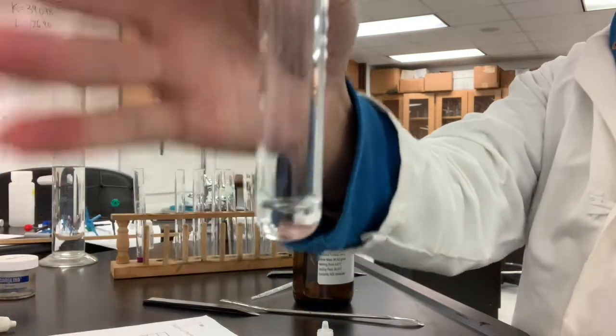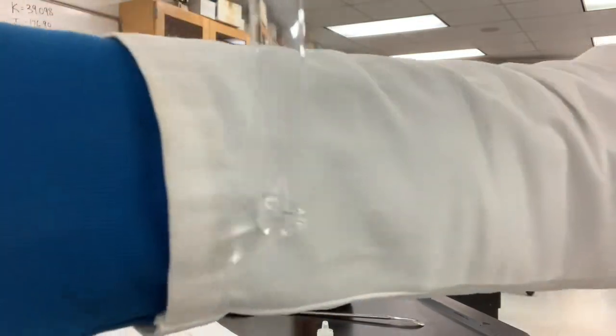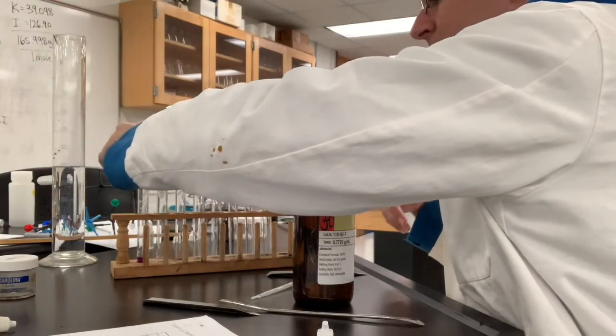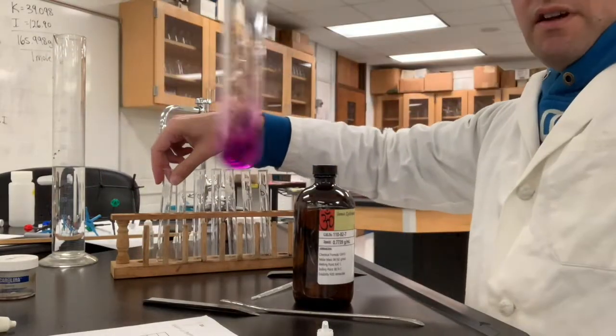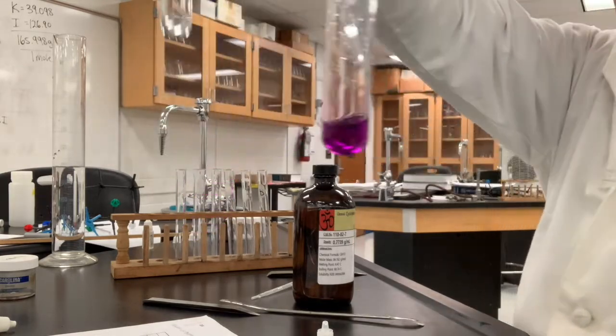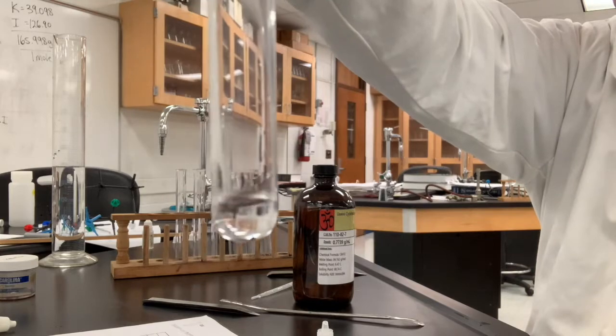Go ahead and make the decision if that has dissolved or not. See that little black speck on the bottom? That's the potassium permanganate there that I started with. So side-by-side comparison — here's potassium permanganate in water, and here's potassium permanganate in cyclohexane.